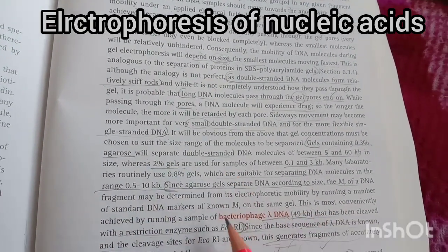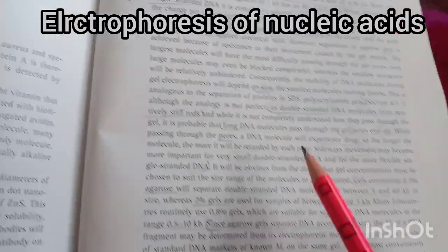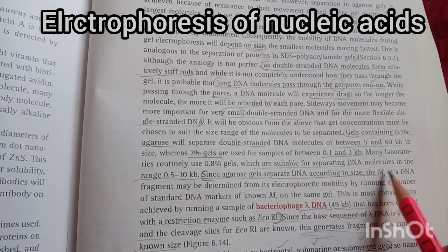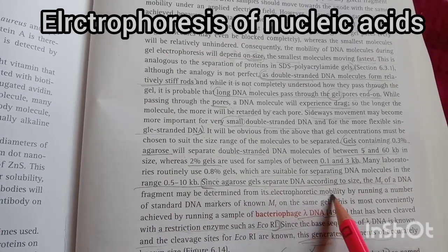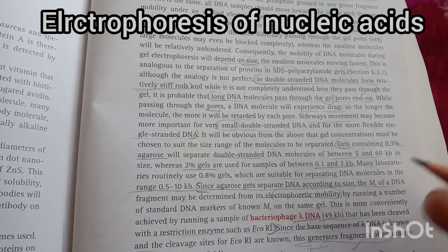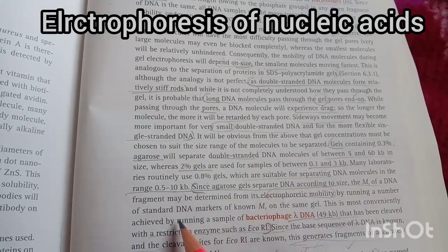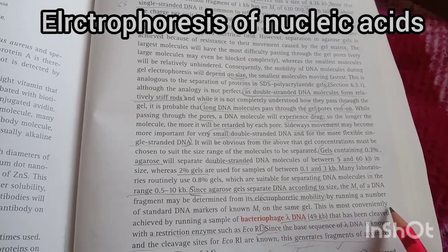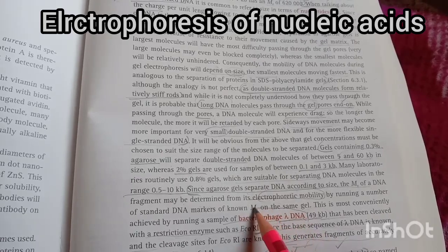So we all know that agarose gel separates DNA on the basis of size. The Mr, that is the size of a DNA fragment, may be determined from its electrophoretic mobility. How fast or slow do they move? By running a number of standard DNA markers of known Mr on the same gel. This is mostly achieved by running a sample of bacteriophage lambda DNA.